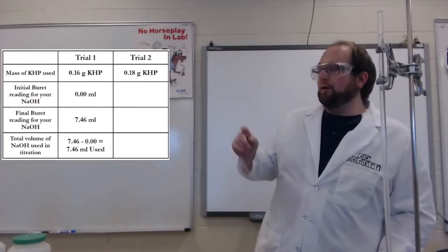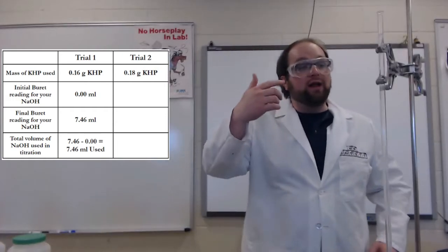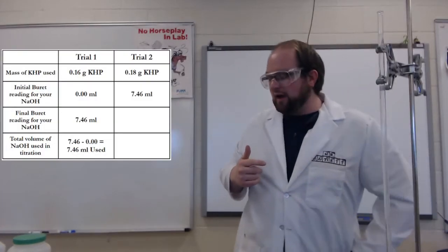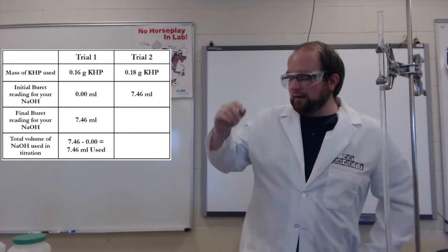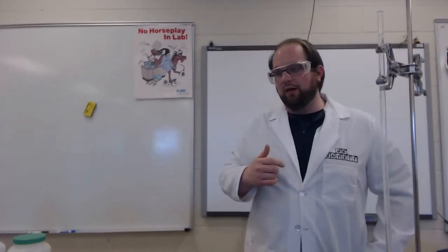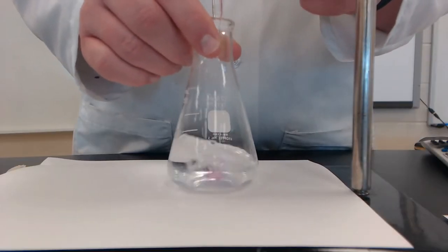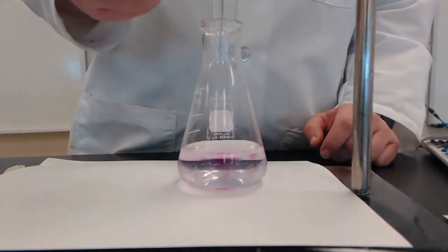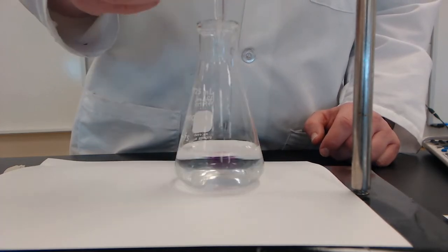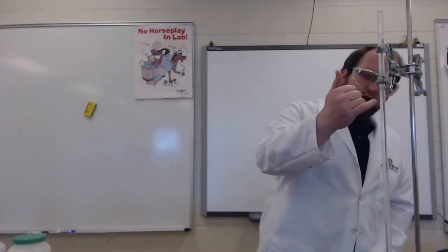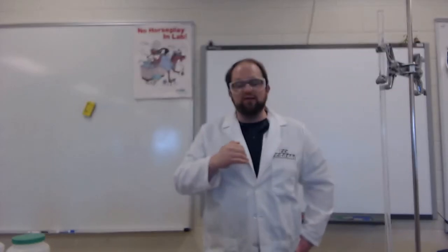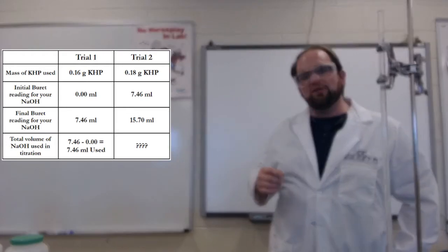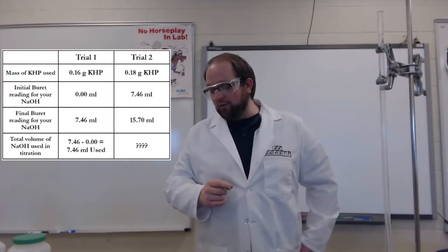As I move into my second trial, this is the one with the 0.18 grams of KHP. My new initial is actually going to be at my old ending point at 7.46 milliliters. Let's see how long this one takes and how many milliliters it's going to end up with. It looks like our final burette mark was around 15.70 milliliters. You should then be able to calculate the total that was used for our second trial, and we now have those amounts of NaOH that were used.